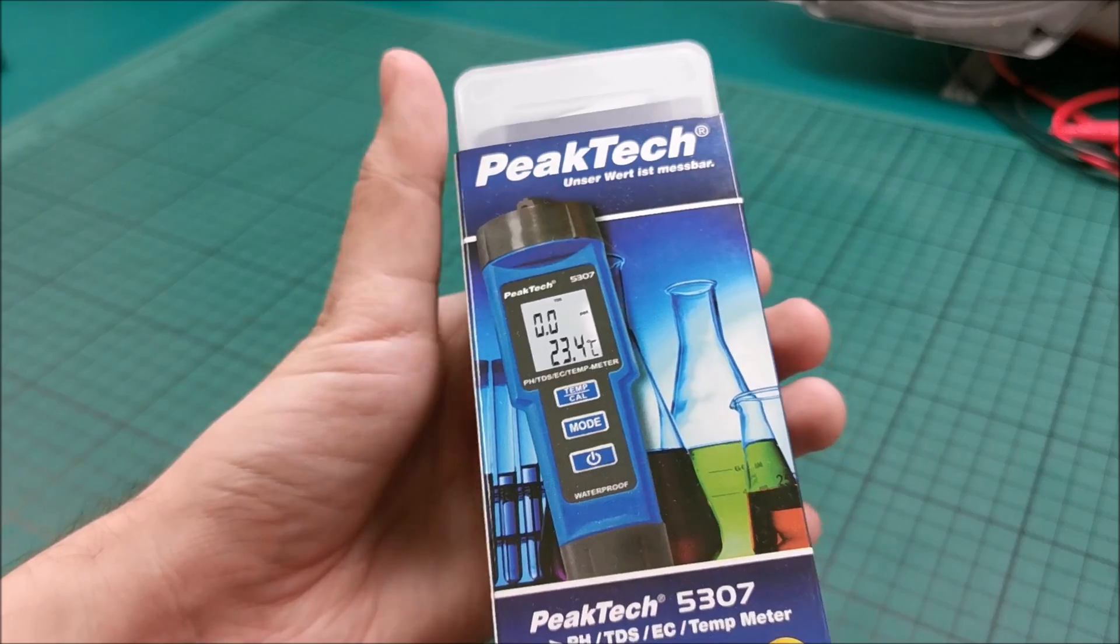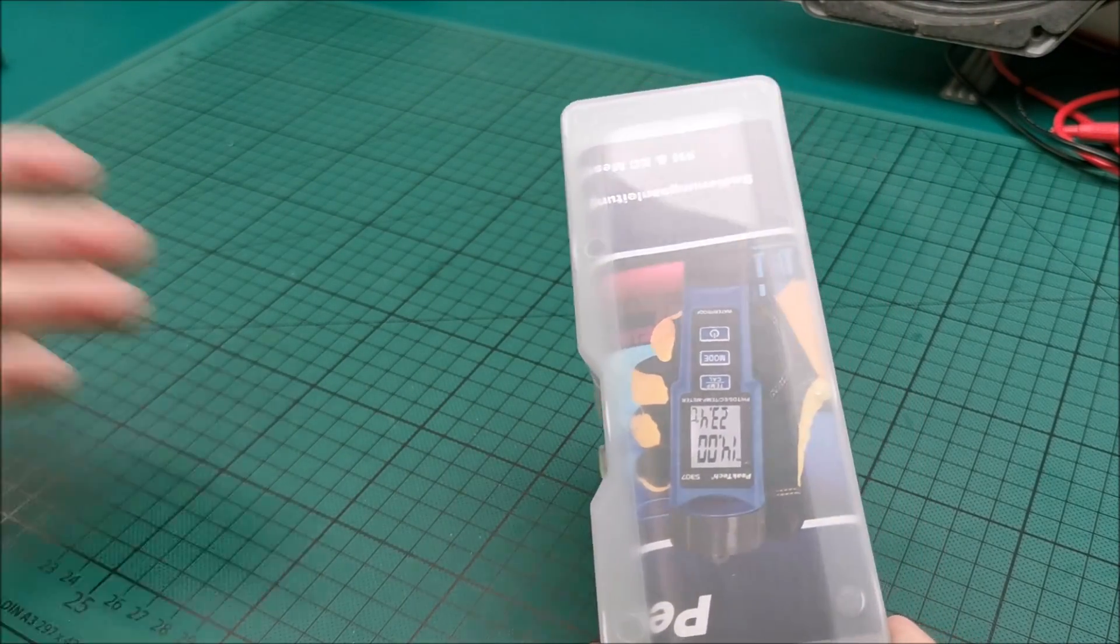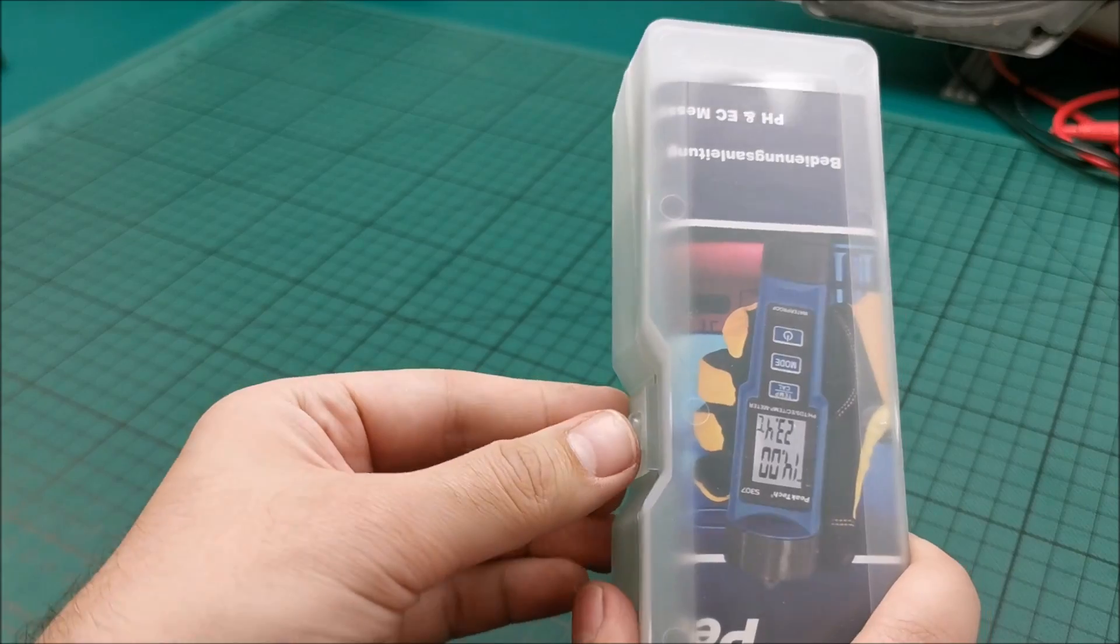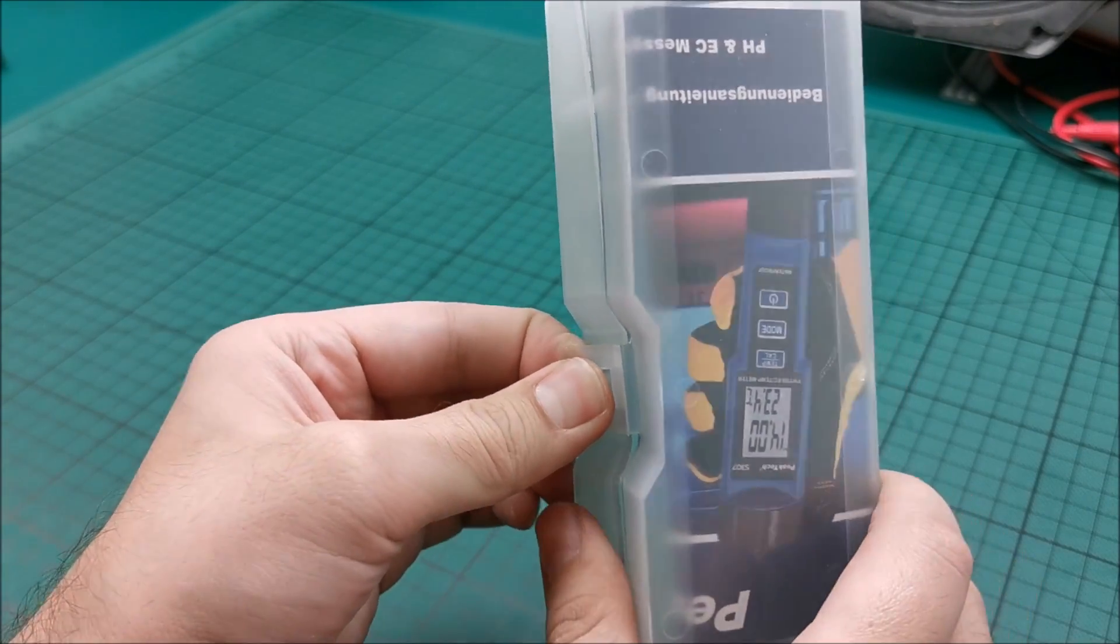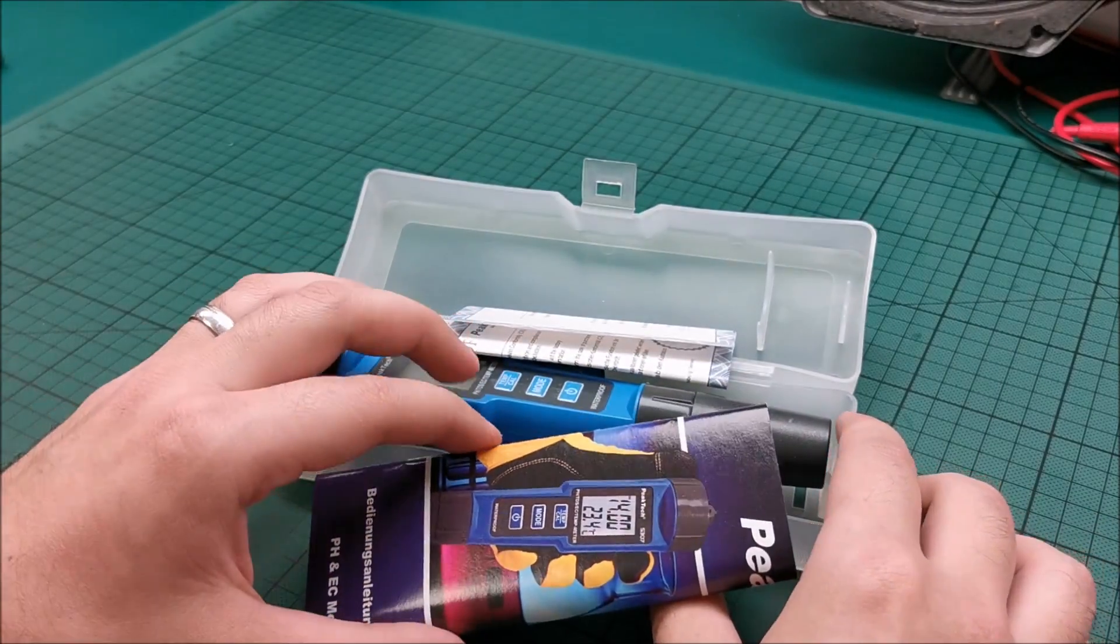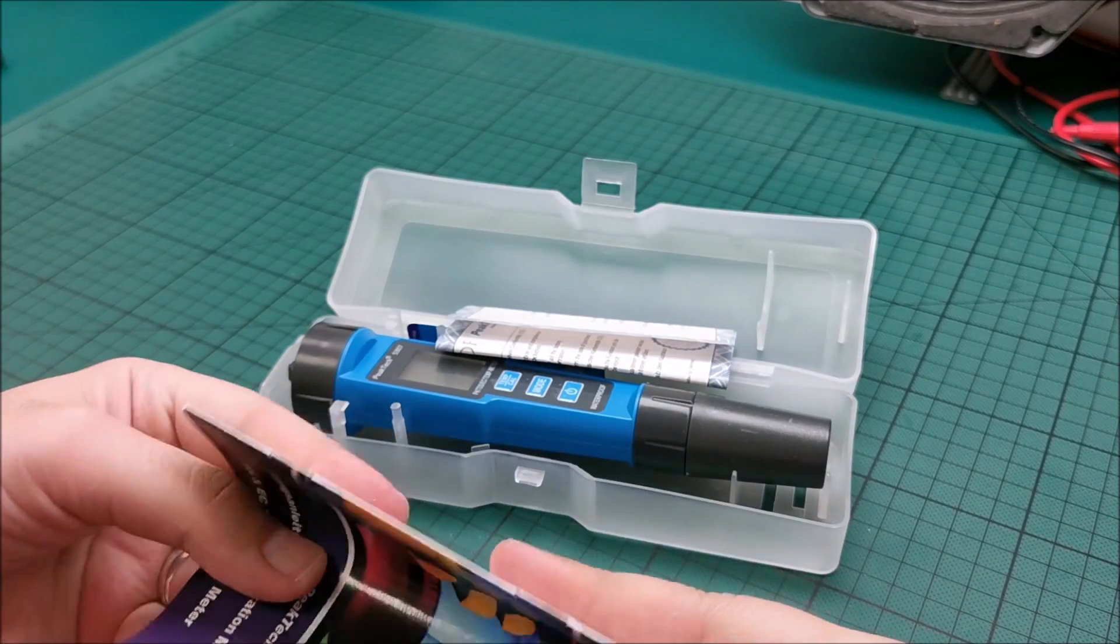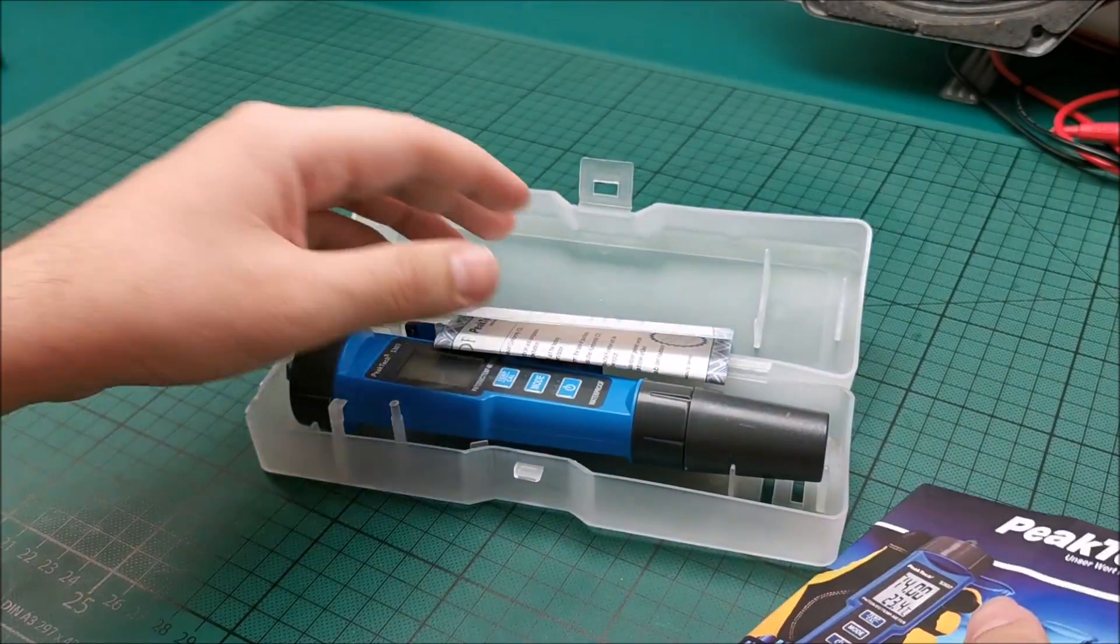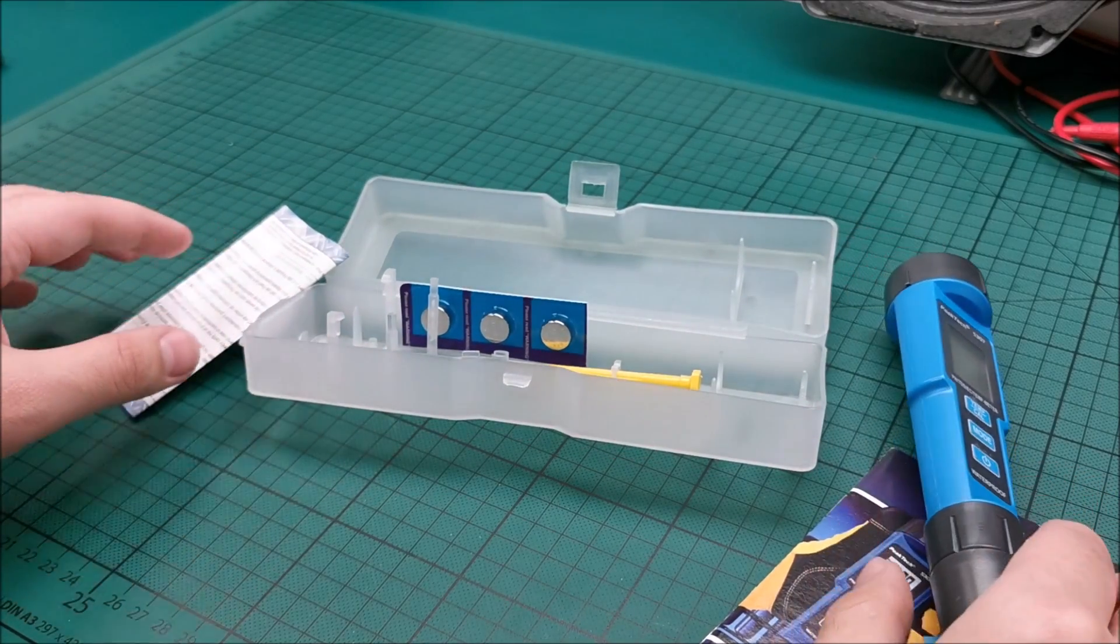So the packaging, that's about all she wrote. You can put that aside. And we will be doing a few just simple and quick tests in this video. Nothing fancy. I mostly want to show you around the tool, not how to use it. Because myself will need to properly learn how to use it. It's not like I really know. But for simple stuff, I think it's simple.